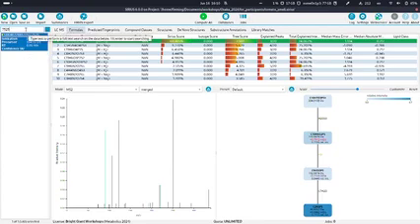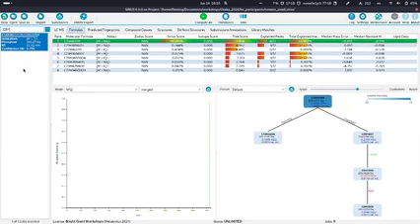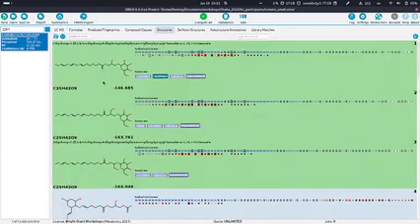Okay, and then what I really wanted to show you is an example where we can show the difference between the 2 confidence score modes. So we are now in the approximate confidence mode. So we have here confidence in parentheses A. And if we go to the structures, we can actually see that now 3 structures are highlighted.